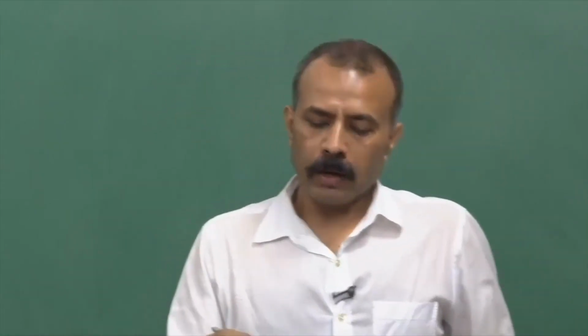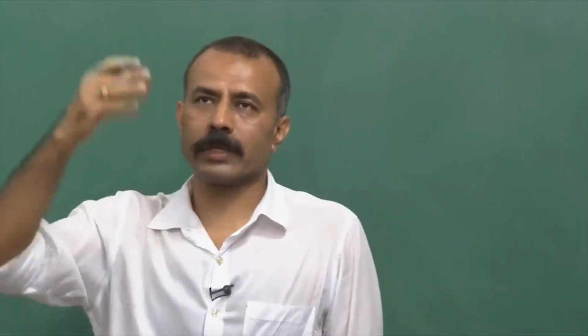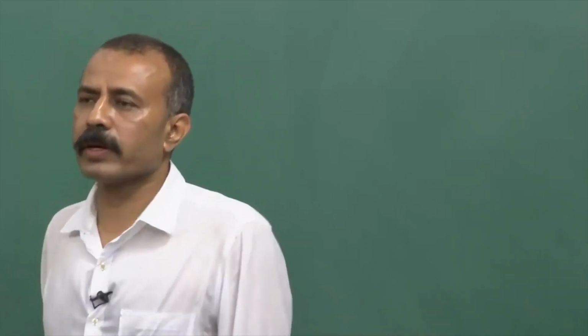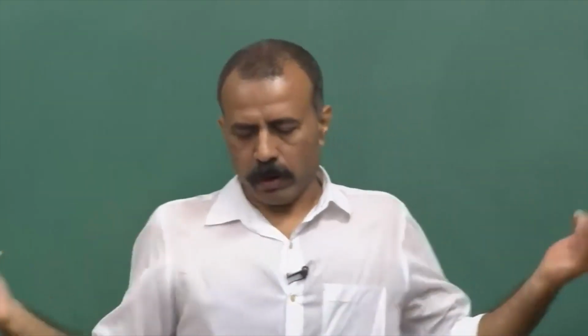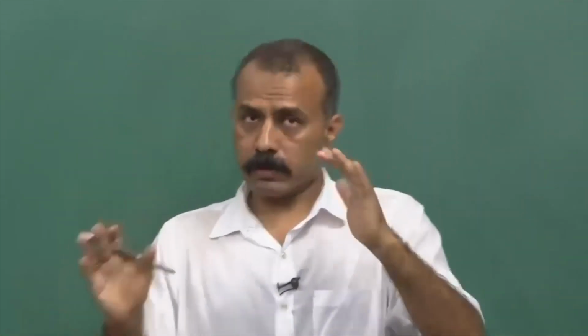Now, on top of that you have these dissociated cells, right. You have dissociated these different kinds of cells in a particular buffer. And I told you, you make these layers, for example, layer 1, layer 2, layer 3, layer 4. On top of this, say you make this layer of 4 ml or 6 ml, whatever, I will leave it up to you, because it depends on the cell types you are using. If you are using pancreatic cells, you have to separate the islets of Langerhans and all those things. You need a different kind of layering, but the logic is the same.